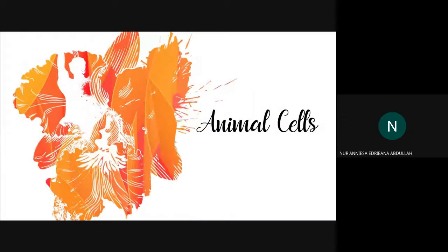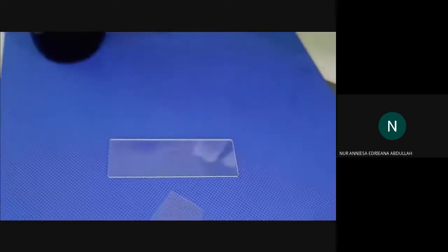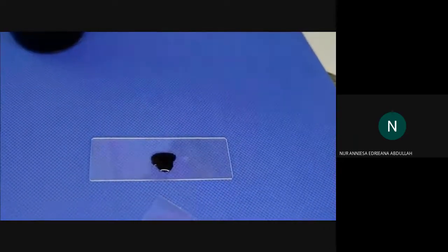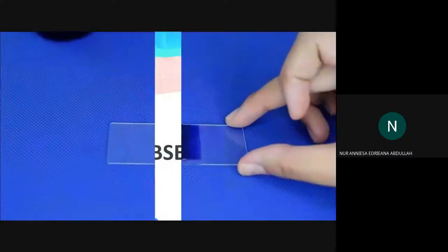For animal cells, we are going to use cheek cells and stain them with methylene blue. Use a toothpick to gently scrape the inside of your cheek. Then smear and mix the cells in distilled water. Next, put a drop of methylene blue to stain the cells. Place one edge of the cover slip to one side of the stain and slowly lower the cover slip.